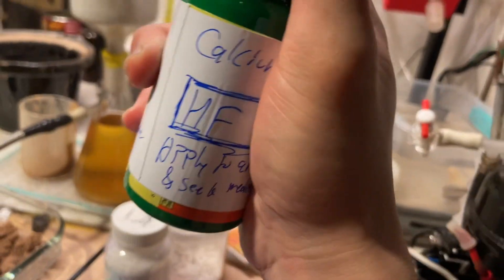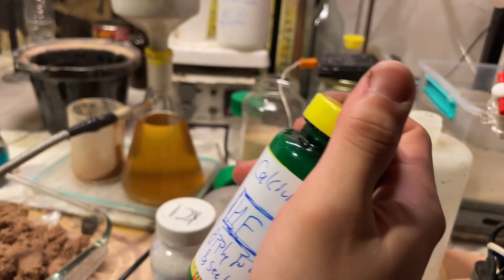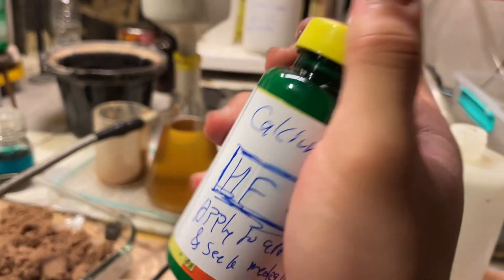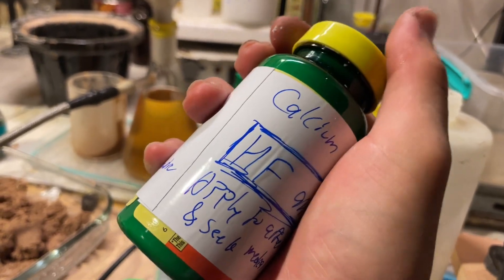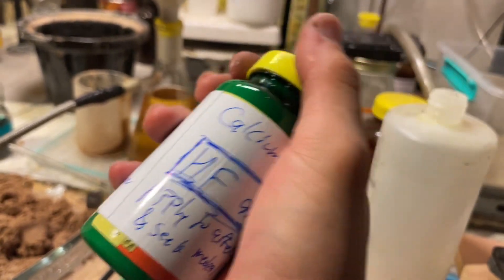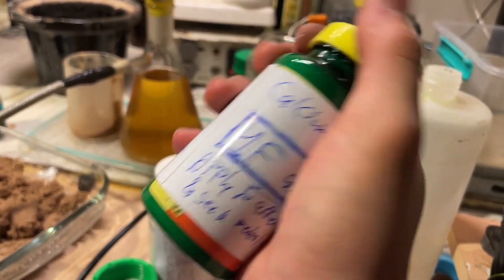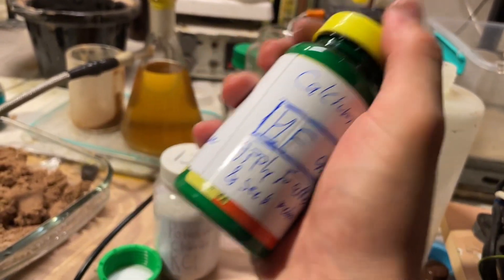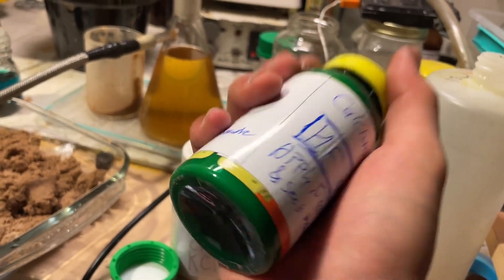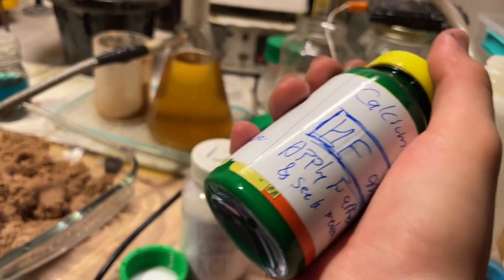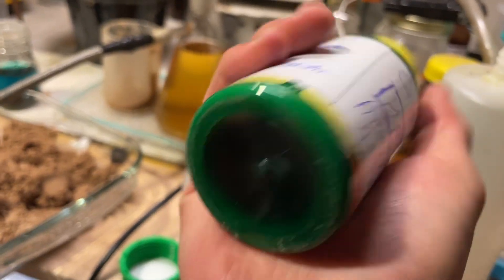Now, of course, a note about this. If you do make this and you get hurt from playing with HF, that's not my fault, okay? Second thing is that this is not the panacea to curing HF. You have to run your hand underwater and then apply this and then you have to try to wash as much of the HF off as possible. You can't just simply leave it on there. So yeah, this is really to buy you time, not to solve your problem. If you're going to get exposed to HF, go to a hospital after applying this stuff.